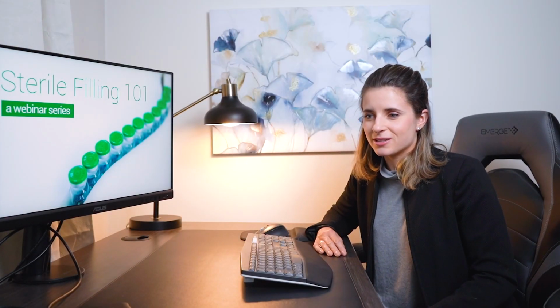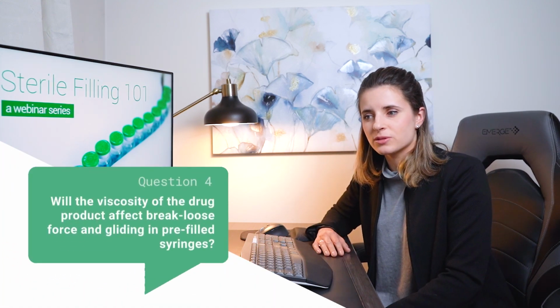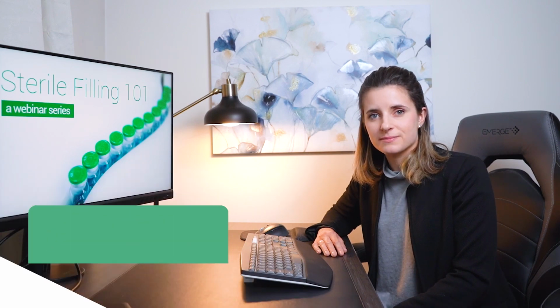Well said. I have a question for Anel. The question is, will the viscosity of the drug product affect break loose force and gliding in pre-filled syringes? Actually, yes. We definitely see a trend of more viscous drugs today. And the viscosity of the drug can impact the break loose and the gliding forces. It will increase. The more viscous the product, the higher the gliding forces and activation force will be. Usually, this is something we observe with any kind of plungers in pre-filled syringes.